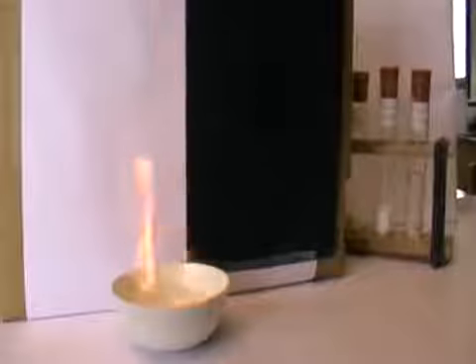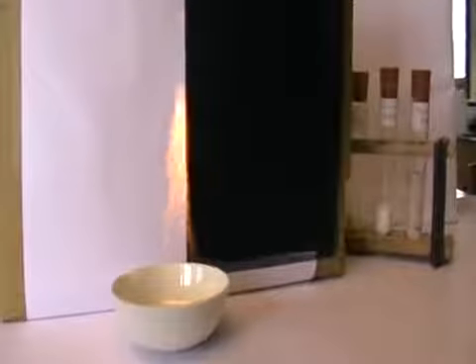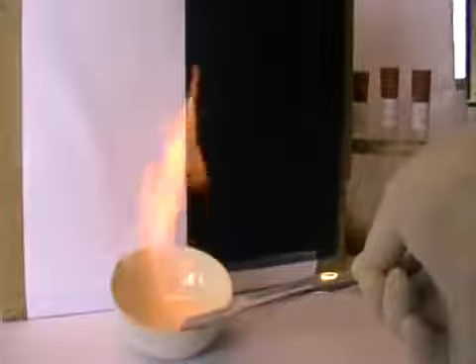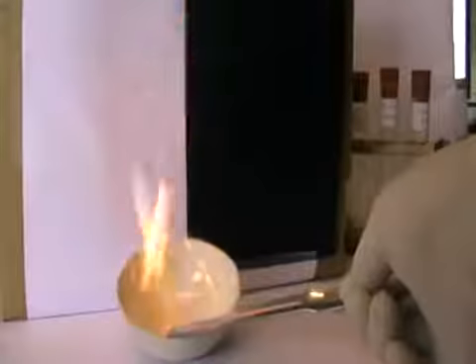So the liquid is clearly very flammable. What colour would we record there? It's a yellow flame. And we should look to see whether the flame is sooty. I would not describe this as a sooty flame. Maybe small amounts of black smoke, but very little. I would not describe it as a very energetic flame, but it's certainly flammable, burning with a yellow or orange-yellow flame, and we describe that as a clean flame. We can't see any real sign here, or very little sign of the white dish turning black, maybe dulling slightly.